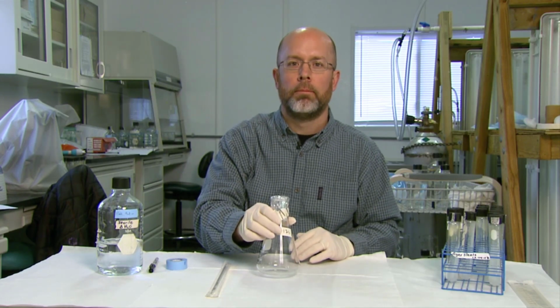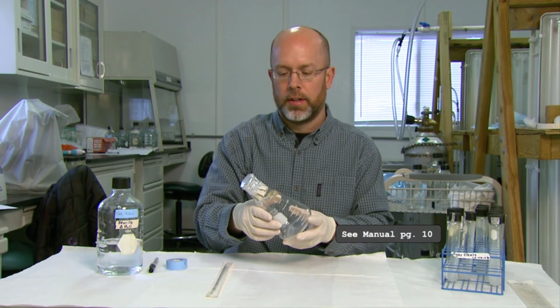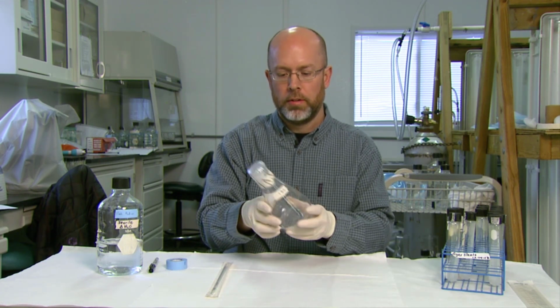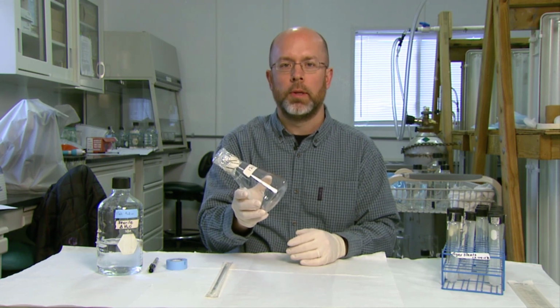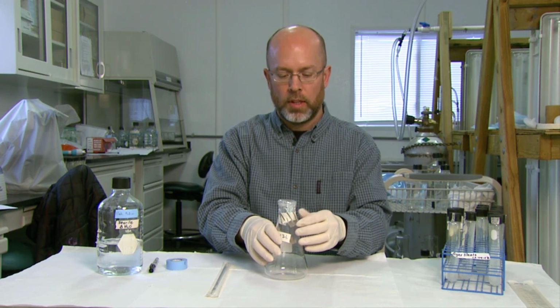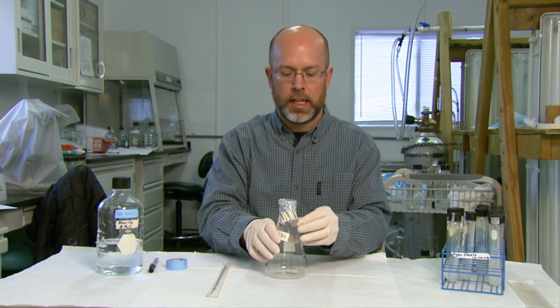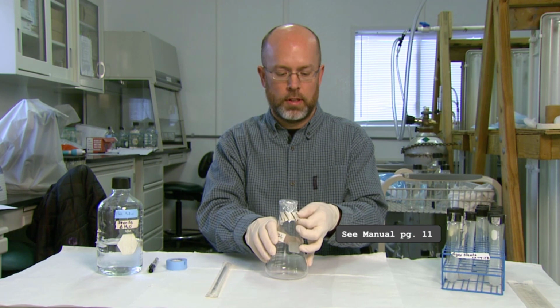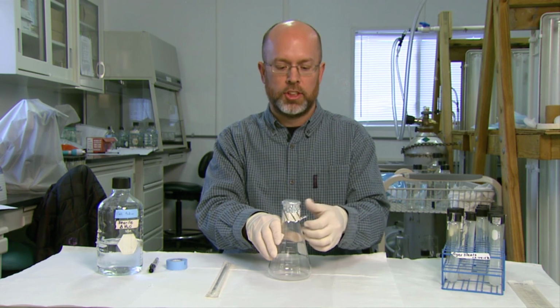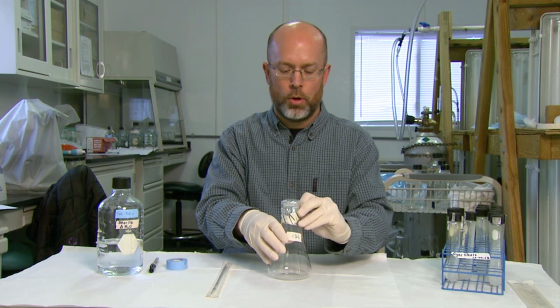So this is the second step. This is flask culture. And you can see on this flask here, we have the autoclave tape around the top and covered with aluminum foil. So we know that this flask, the inside of this flask, is completely sterile. So we're good to go there. So what I'm going to do is transfer the culture from the slants that we just used now to this second step. So obviously, as I mentioned before with the slant culture, all of this needs to be done under the hood in a sterile environment. I'm only doing it out on this table for demonstration purposes for the camera. So always keep that in mind.